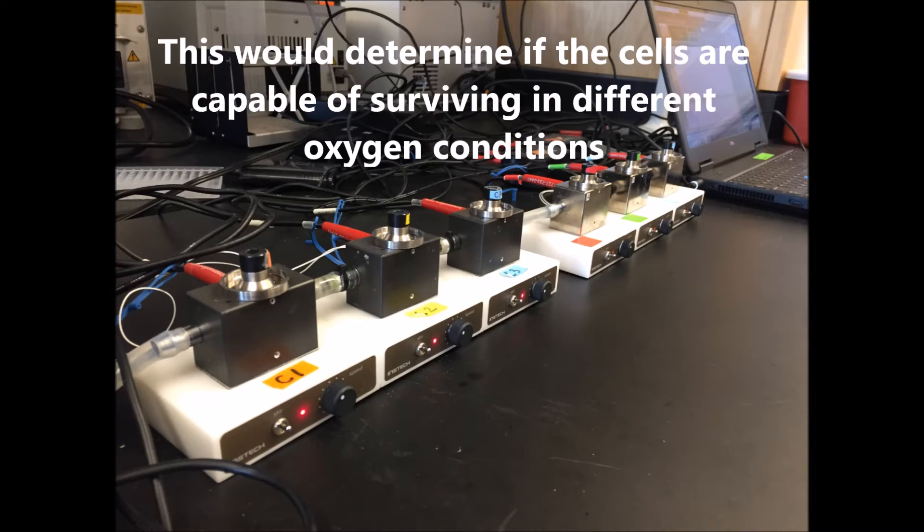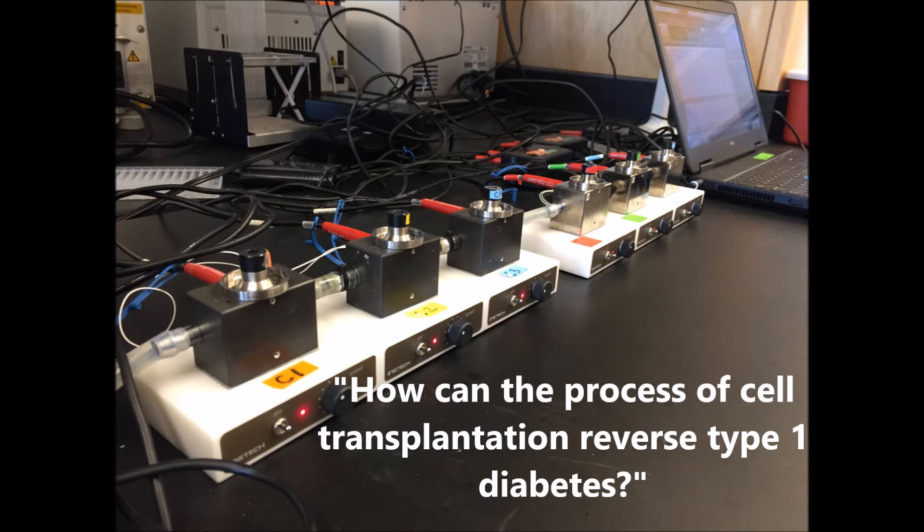With this tool, we would be able to determine whether or not the cells being studied would be viable enough to be used in an in vivo model. Determining whether the cells are viable in different oxygen conditions would contribute to answering the main question: how could cell transplantation reverse type 1 diabetes?